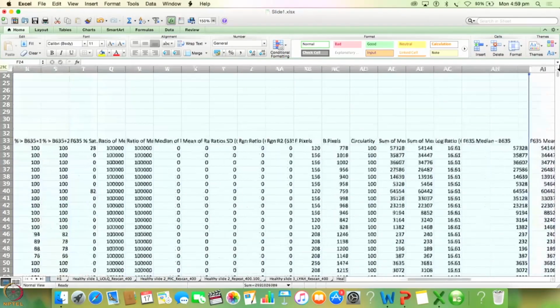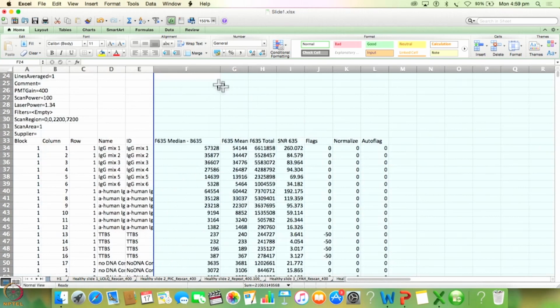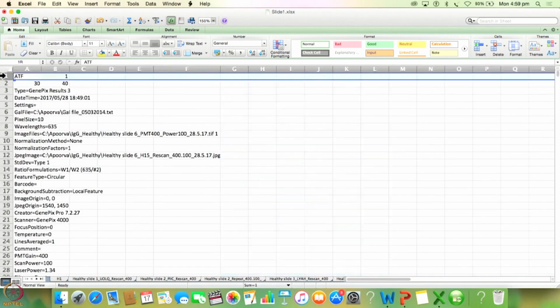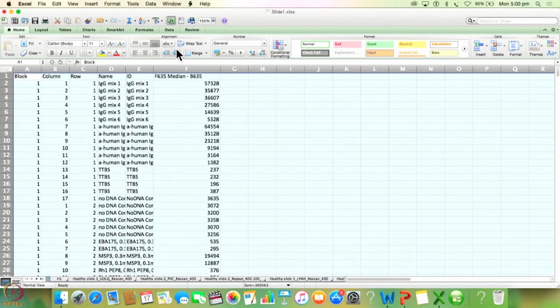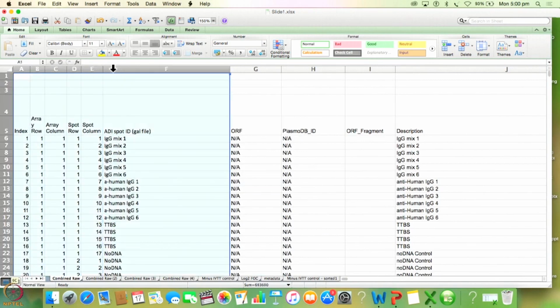to make this Excel less complicated. Let us delete all of this and then we go and delete this as well. We also do not need these parameters for the analysis. I am also going to delete this. Finally, this is what you get. Now you keep scrolling down and then you arrange all patients side by side. When you do that, this is what you get. You also see that there are additional columns here. This is what you get from your GAL file.